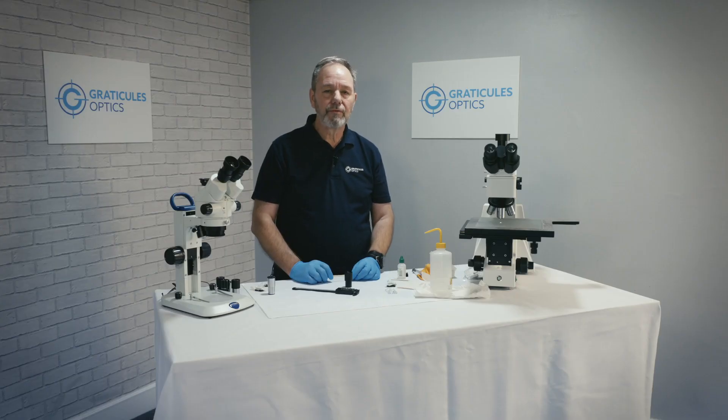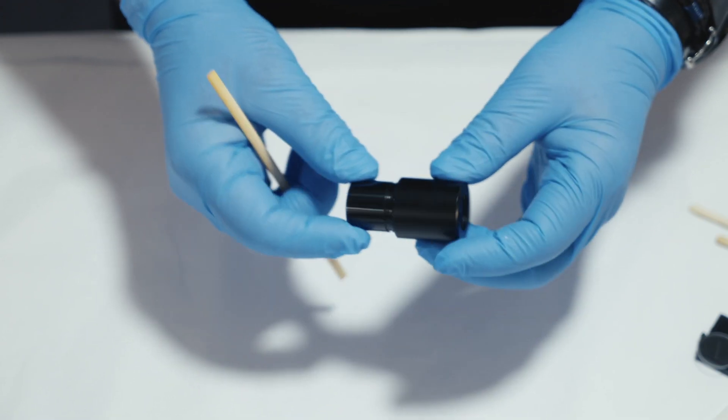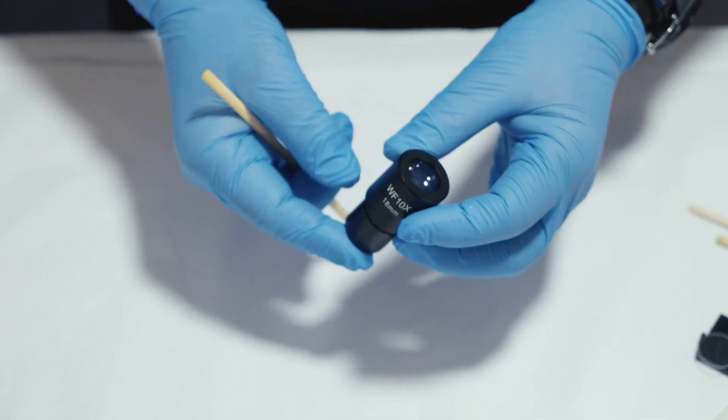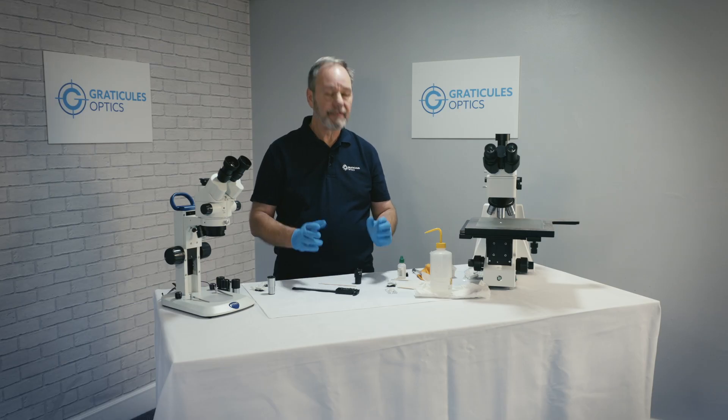One of the most common causes of contamination when disassembling an eyepiece can actually come from the eyepiece itself. When you unscrew the assembly, small pieces of the black anodized coating can come free and fall inside the eyepiece. To avoid trapping loose debris inside the chamber, make sure you clean all the eyepiece components once disassembled.